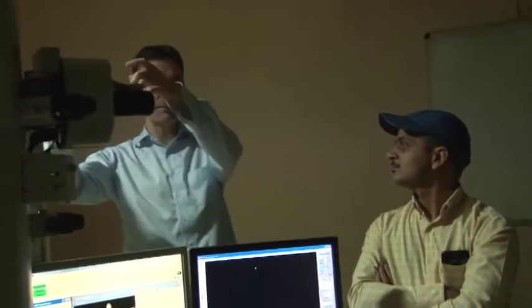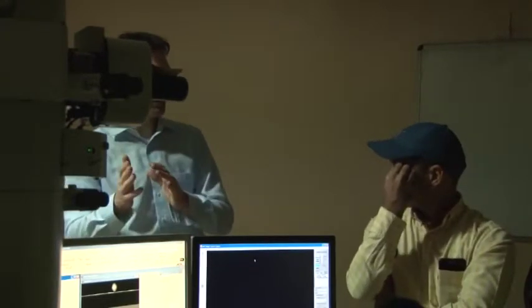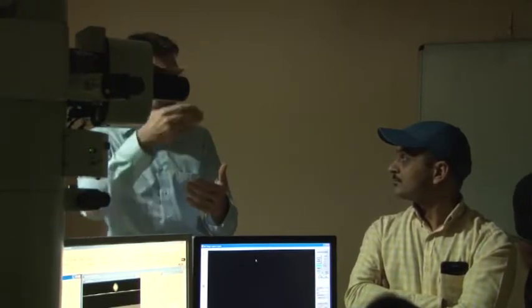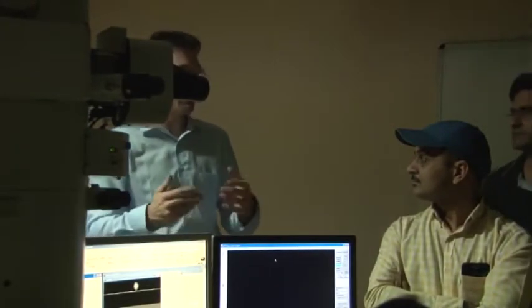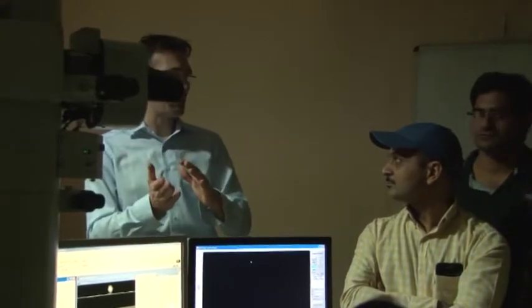But if you spread the beam, the spot will move, because this is in principle a tilt, since your aperture is off. You shouldn't apply beam tilt now, although we have beam tilt available, because there are things that interplay, and you have to separate those. If you go through good training at the microscope, you should be able to. There are manuals available on how to do this stepwise. You have two options: either you simply follow what you do, or you somehow understand to a certain extent what you do. In principle, because you can compensate for beam tilt, you might be able to compensate for such a movement, but this would not be correct. It's not only a movement.